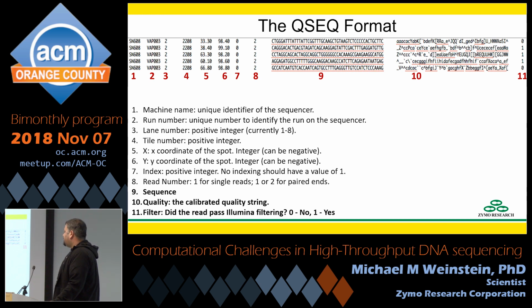The information that's more pertinent to the data, the index number, the read number. So I won't get into this too much, but you can read sequence from one end, or you can read sequence from both ends. The information presented can be useful sometimes from both ends, and sometimes the information from both ends is no more use than the information from a single end.